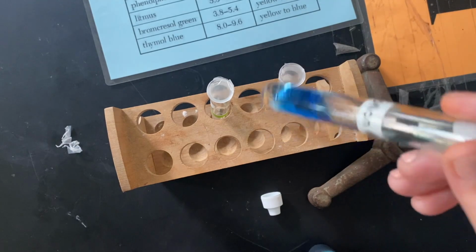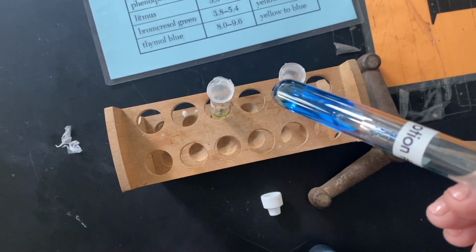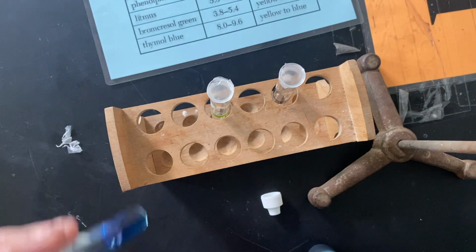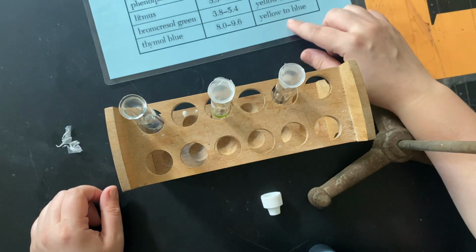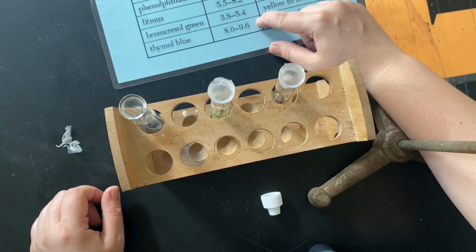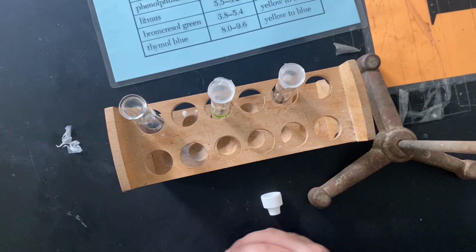We can give the test tube a nice little swirl, and we see that the color is blue. So this is potion number 1. It turns blue. Now with that, what does a blue solution using bromocresol green tell us? Again, it tells us it's 5.4 or higher. And then we'll be able to use that information to determine if that potion was brewed correctly or not.